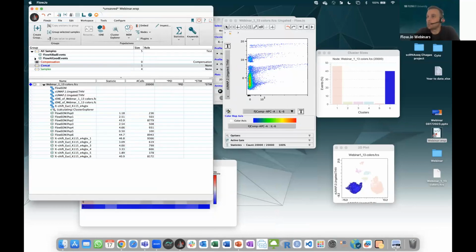When I run T-REX, the populations do not add up to 100%. Is this expected? Yes, the different clusters of T-REX are not going to add up to 100% because it's only going to cluster the population of cells that change between the different conditions. It's just going to show the clusters that appear or disappear, and everything that's not changing it's going to totally ignore, and that's the gray population it gives you. I'll show you live when I stop answering all those questions.